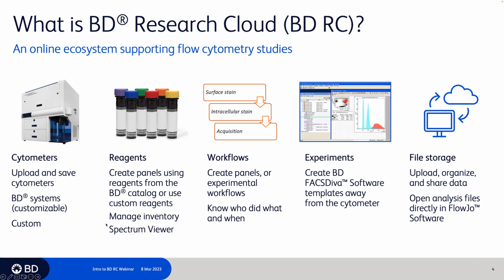You can manage your reagent inventory that's in your lab. You can use the spectrum viewer. You also have access to workflows. So panel creation workflows are also experimental workflows, to keep track of who did what and when to your cells prior to acquisition. And this ensures all your data stays organized and clear.